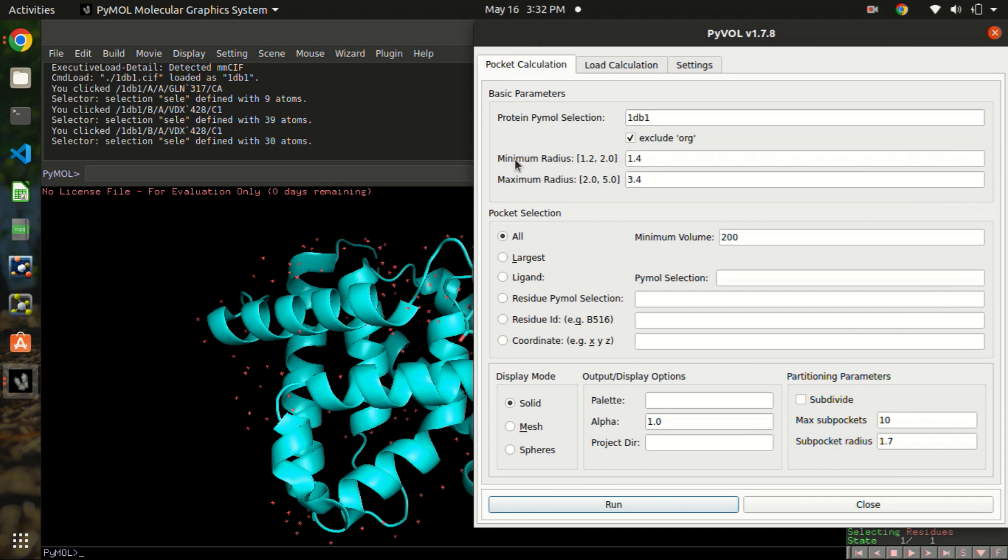Now this is the minimum and the maximum radius. You can always tune these parameters if you don't find the suitable volume or suitable pocket that fits the ligand in.